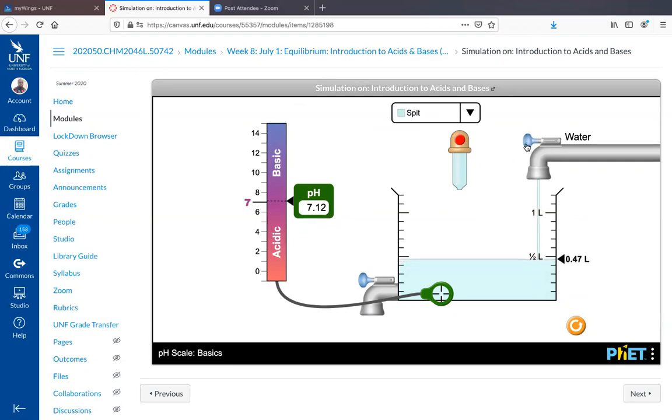Because I've done this and I know the value. Look at the pH value, it's changing, all right? I don't want to overshoot, so maybe just go slowly until I add 0.9 to make it 1 liter. Oh, I didn't get it. You see, this is what happens all the time to me. So I'm going to dump that.